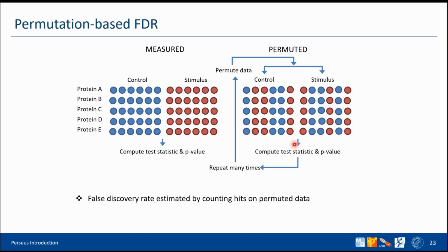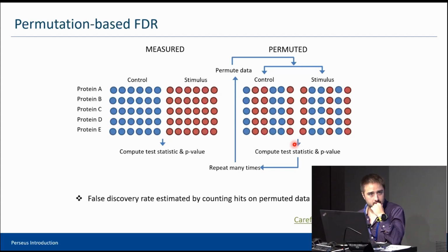Okay. We have a question. I'm wondering, for biological replicates, if you have time series data and gaps in some of that data, are there ways to account for that? Yes, for sure there are. We will see them later. Imputation will be one, which also has some assumptions, but I would normally filter out the data that has too many missing values and then do imputation. This is what I would do. I don't know if you have a comment. Actually, we will do it in the first tutorial, and if you have more questions, just feel free to ask. Thank you.